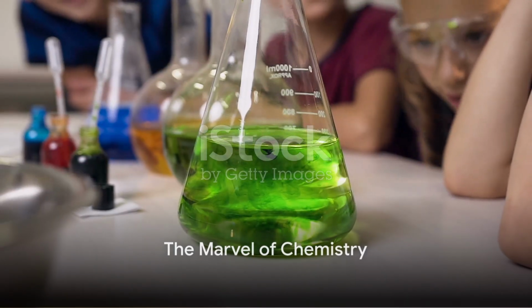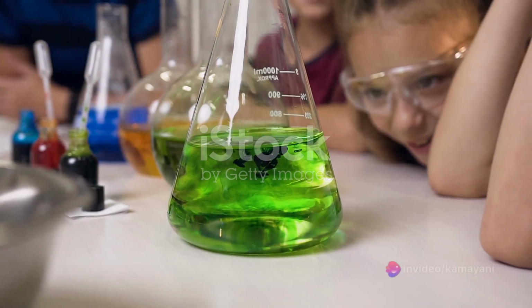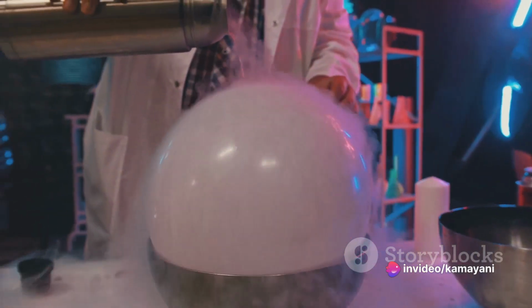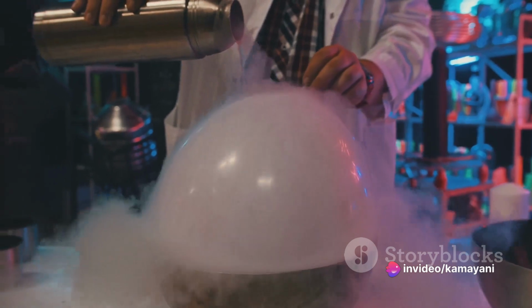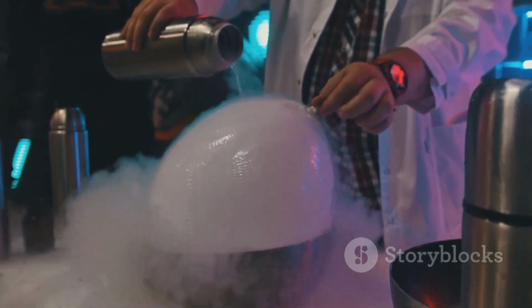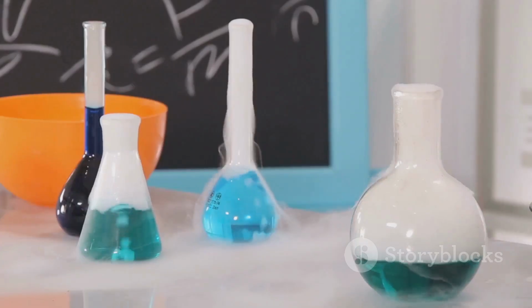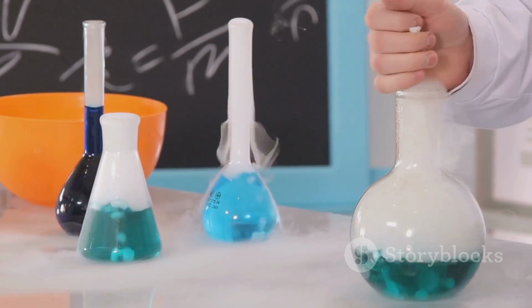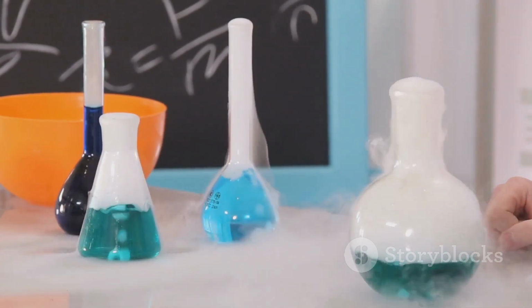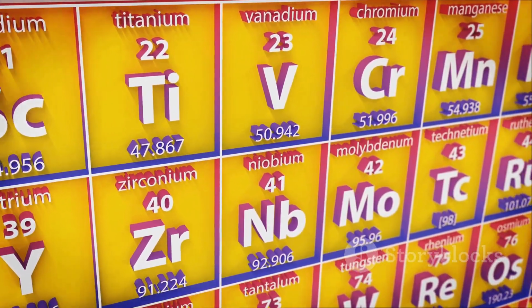It allows us to observe and understand the intricate transformations happening right in front of our eyes. So the next time you see an iron nail and some copper sulfate, remember the fascinating reaction that unfolds between them. This is the beauty of chemistry. It's not just about memorizing equations and reactions, but about understanding the principles that govern these reactions. It's about making sense of the world around us, one element at a time.